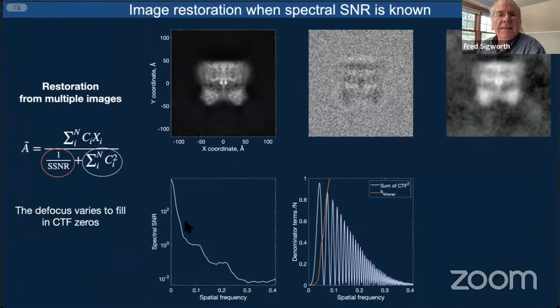And this is why being able to preserve the low spatial frequency components is so important, at least in finding a particle. You're going to need these higher frequency components for alignment and 3D reconstruction, but these low frequency components, which arise in the general envelope of the molecule, are much stronger.